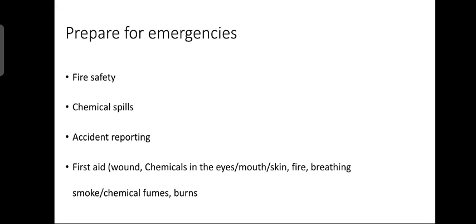Okay. Next is burns. Hold the affected skin under a stream of running water for at least 10 to 15 minutes. Keep the wound open and do not apply any ointment till expert medical help can be provided. In case of strong acid burns, after washing with water, rinse with dilute sodium bicarbonate solution, that is 1 to 2%.